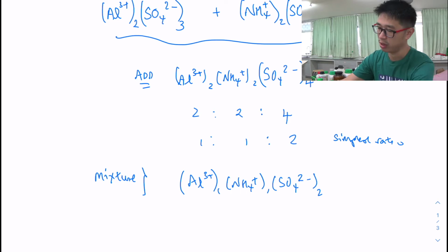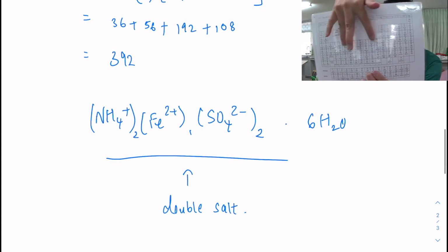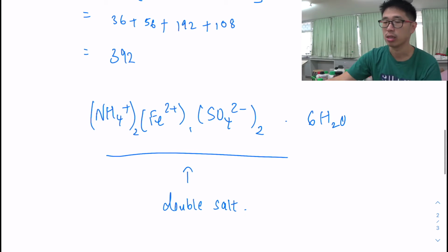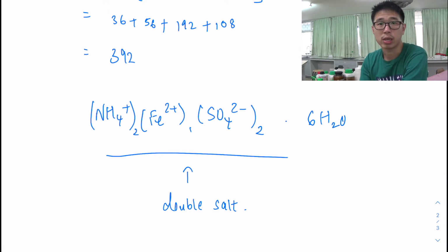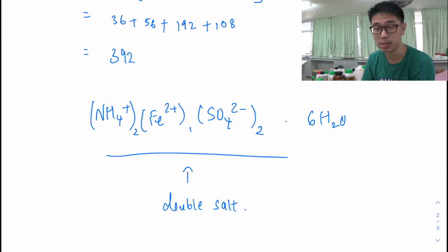Group 3 metal. This is ammonium ions and ammonium salt. They do not contain any transition metals or transition metal cations. Transition metals refer to this series there. So there is the big block of transition metals. You have done this in O-level or IGCSE, and you will carry it forward to A-level chemistry, where you deal with a lot more in depth into transition metal stuff in A2 chemistry. So there was iron 2 ammonium sulfate.